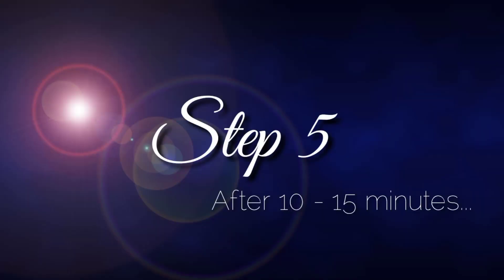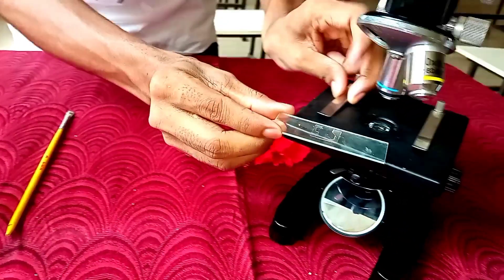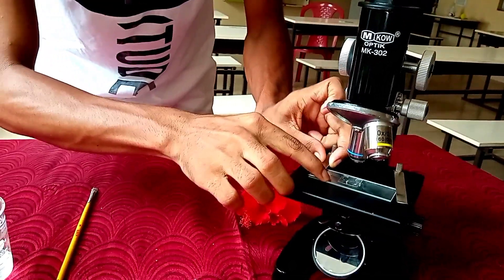Step number four: cover it with a cover slip gently so that no air bubbles appear. Step number five: observe the slide under the microscope after 10 to 15 minutes.